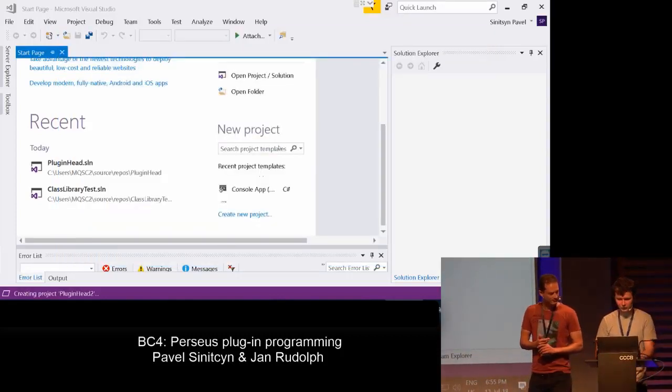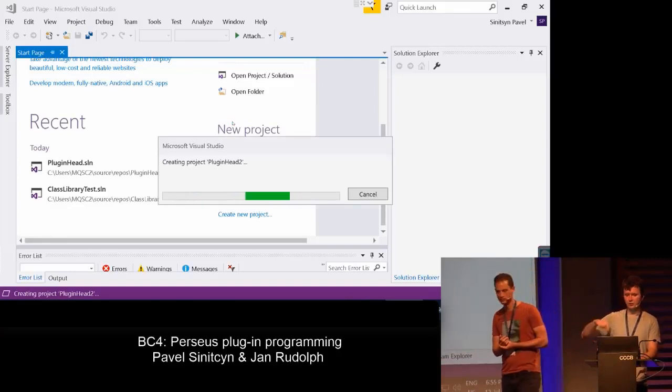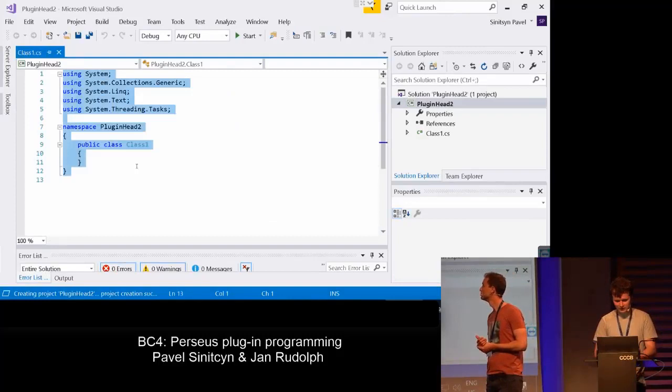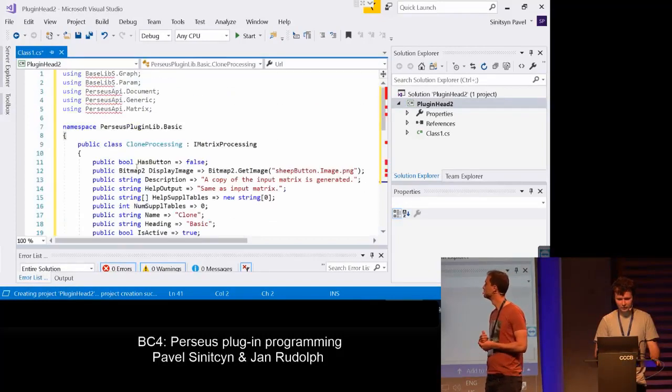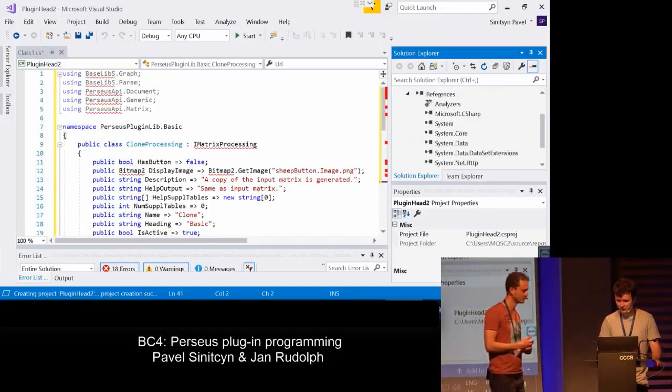So what I'm going to do is copy all the code which we inserted previously into the new project. Yeah, it can happen. Actually, programming is just like going through many problems. And sometimes it's really very frustrating. Sometimes, no.